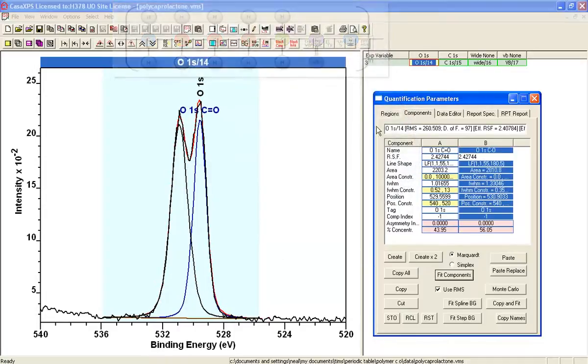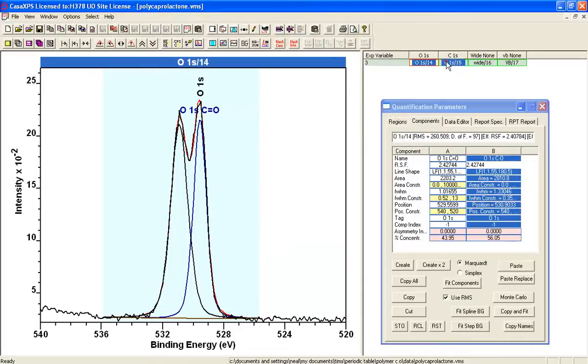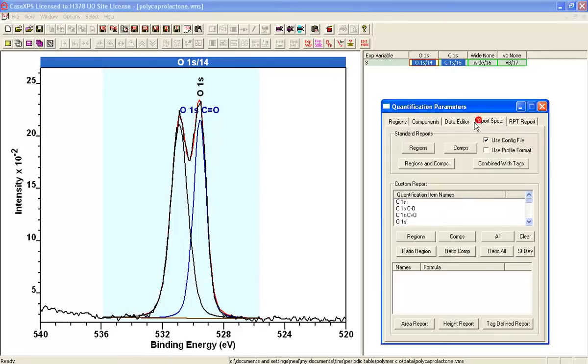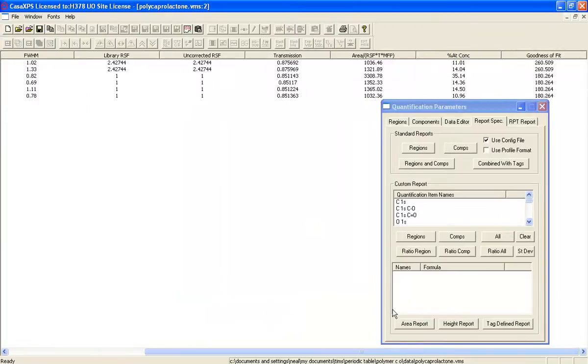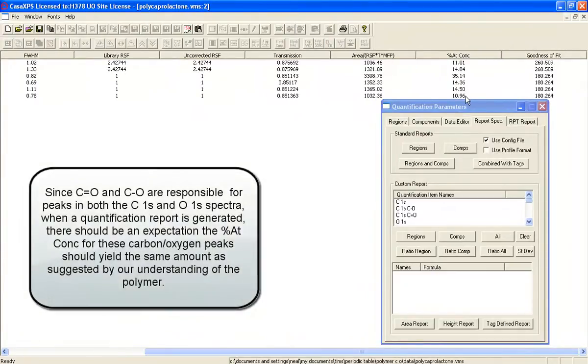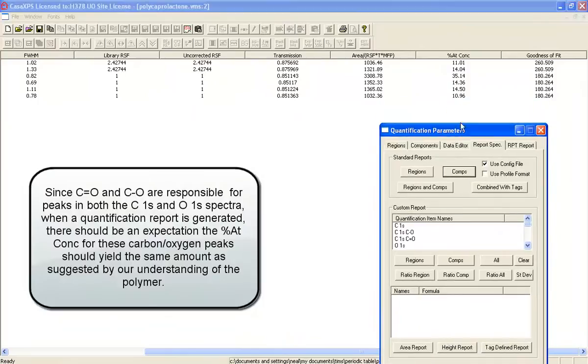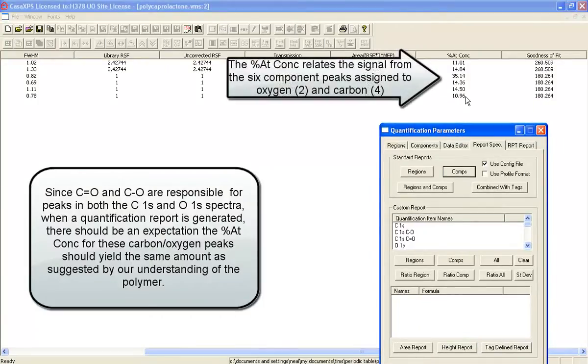And what we would like to do is display both of these as a table. If we go to report spec we can press the components and it will give us a table that gives us the atomic concentration. This suggests that you should have a relationship here between different components and it's actually turned out reasonably well.